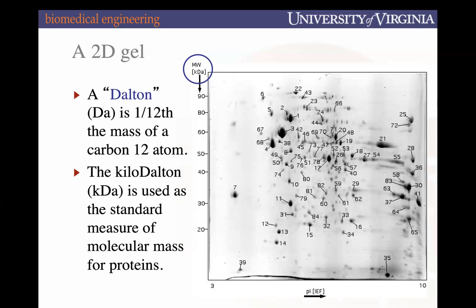Yeah, but again, those are not the exclusive ways by which that happens. Those are just possible explanations based on what we're seeing. Again, for a 2D gel, we don't know what these proteins are yet. There's a way to try and figure that out. We'll talk about that next class. But for now, on this 2D gel, that's why they're labeled by number.